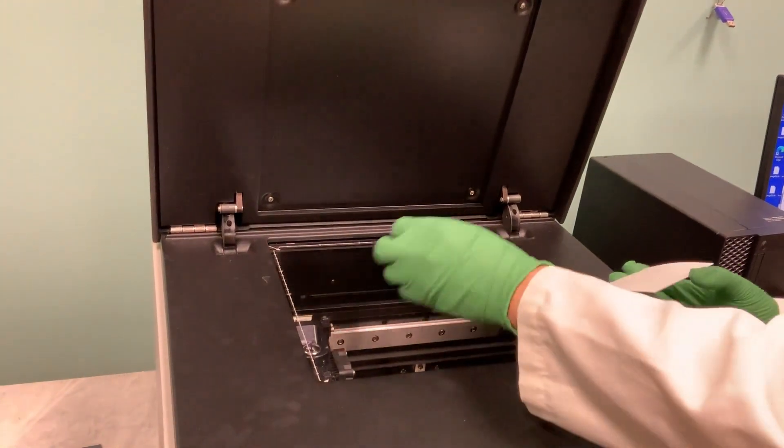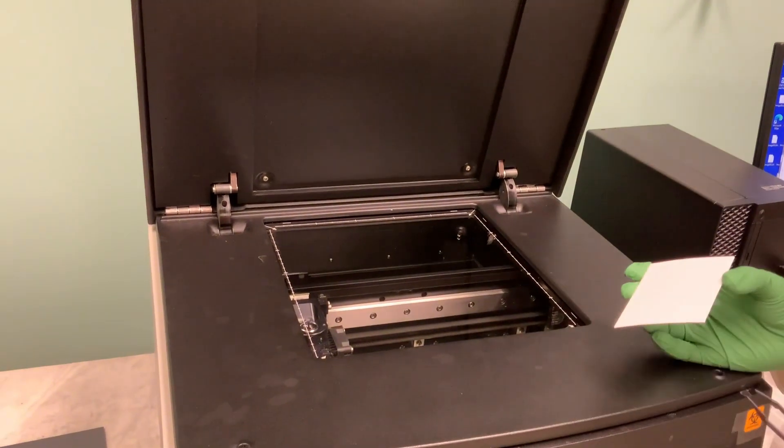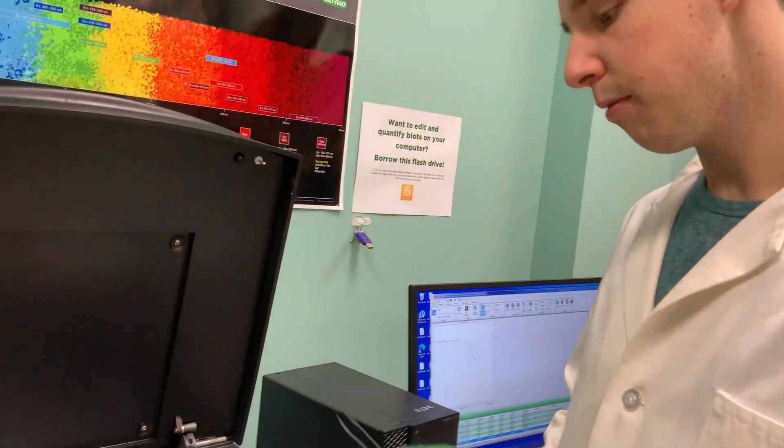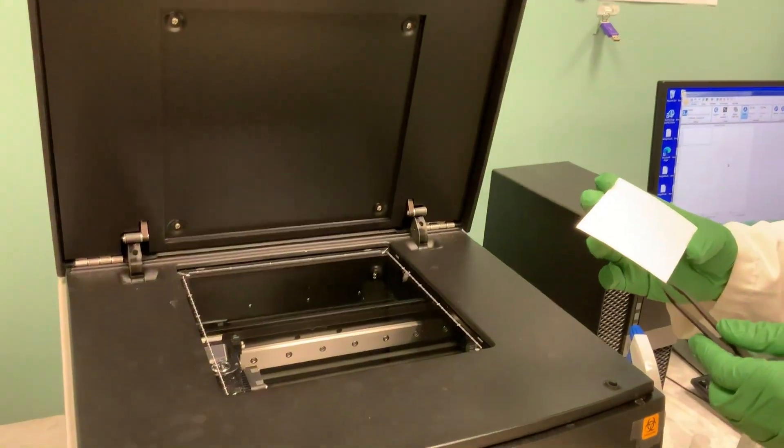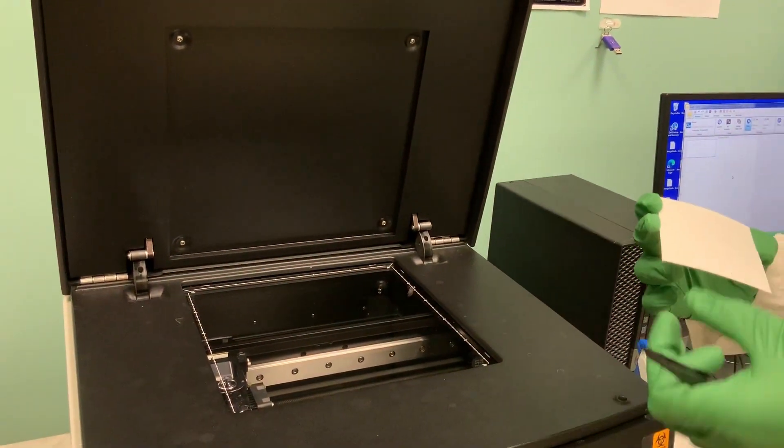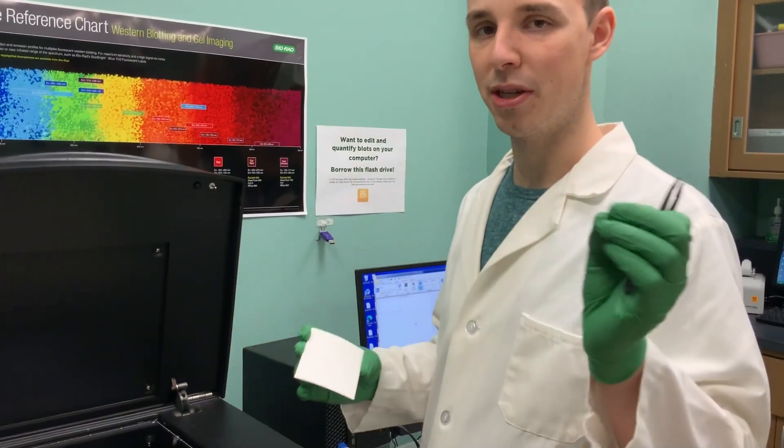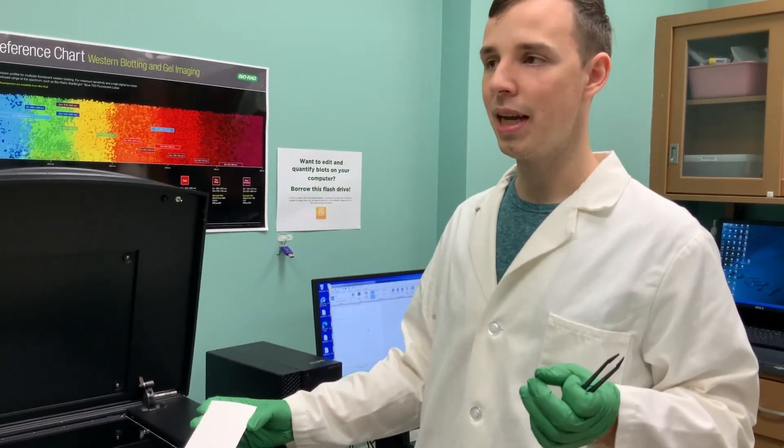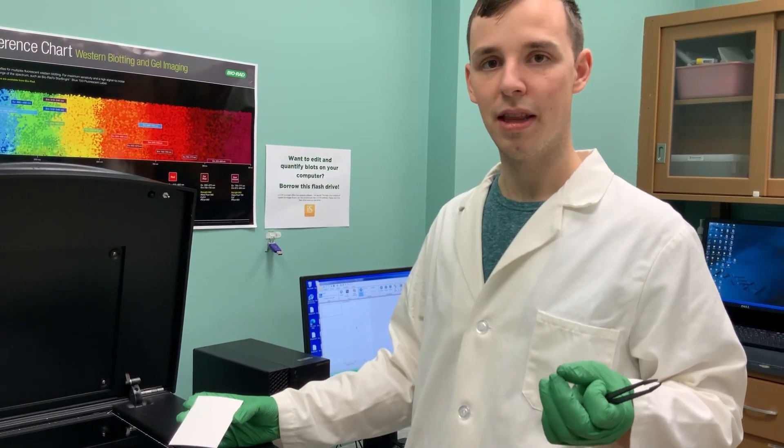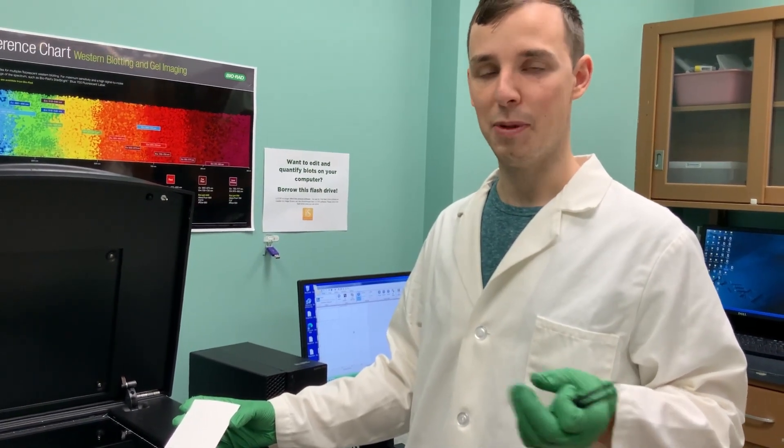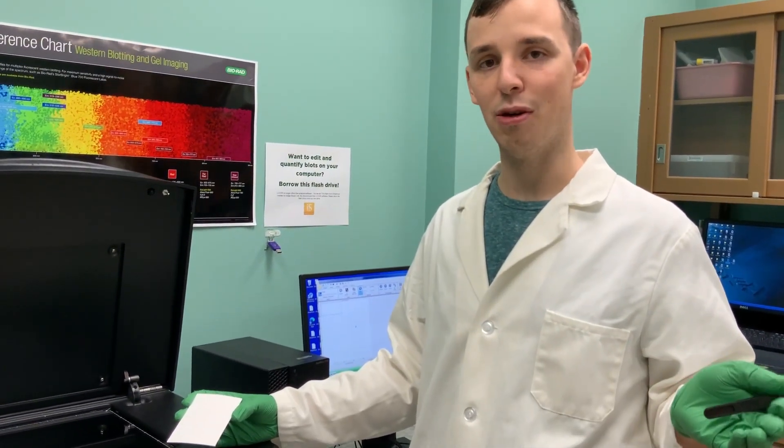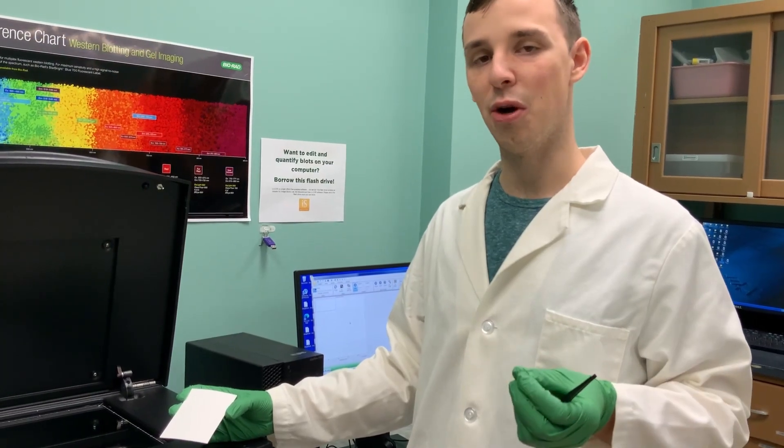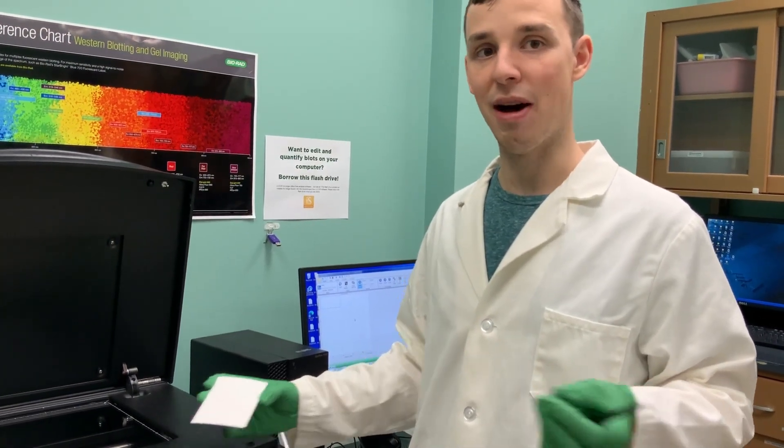If this is dirty, you can use some ethanol and kim wipes to clean this off. Make sure you don't touch especially the middle part of your membrane with your fingers or even gloves because it will mess up the transfer and the image won't come out as nicely.